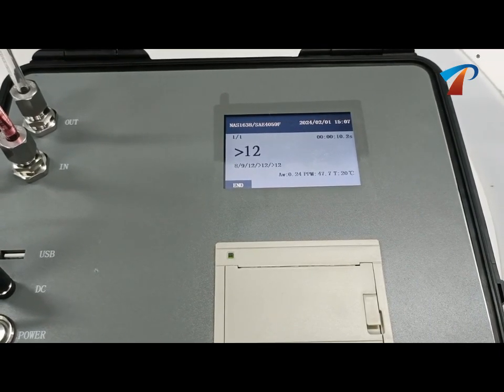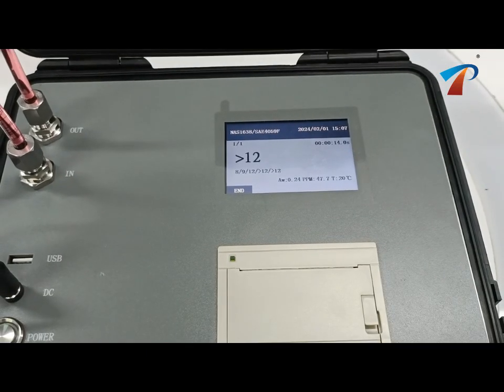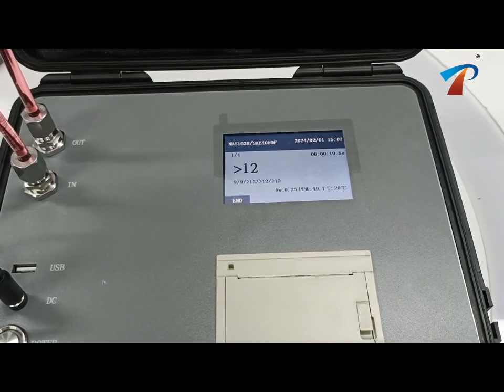And the printed data will show the number of particles for each test, and the bottom is the determination of a grade. You can also switch different standards in the test interface to check the level of other standards.